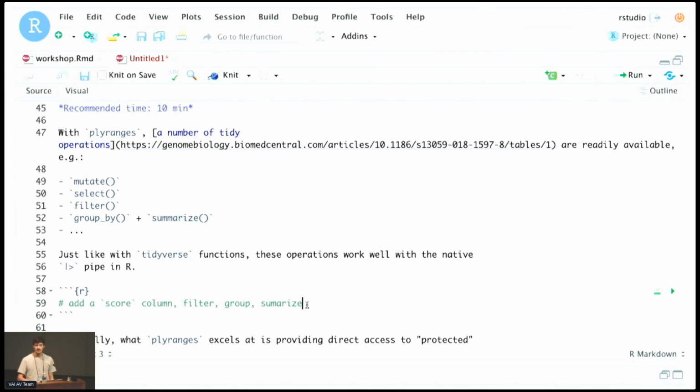But as I was mentioning, if you want to do prior filtering on your data, you will find that that would be exclusively based on tabular information rather than genomic ranges per se. You'll find the tables to be more efficient than genomic ranges. So if you have to do some filtering maybe on a numerical column, then it would be possibly faster to do that as a data frame rather than as a genomic ranges object.